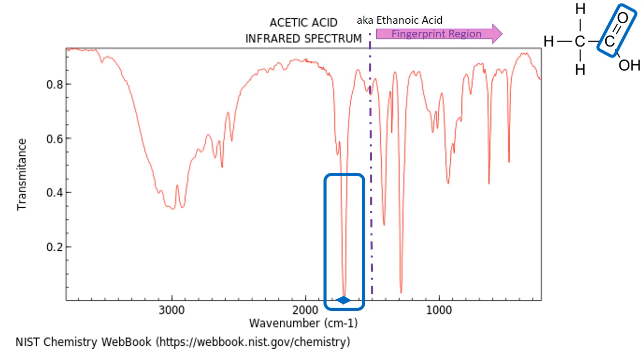The other thing we're going to be looking for in ethanoic acid is the OH bond. Now for carboxylic acid groups, it's going to be absorbed around 2,500 to 3,000. We said earlier, if there's an OH group in an alcohol, it's much higher. What makes it more distinctive in acids compared to alcohol is that it is much broader. So if you go back and compare this shape to our previous one with the alcohol, it's much broader. Okay.